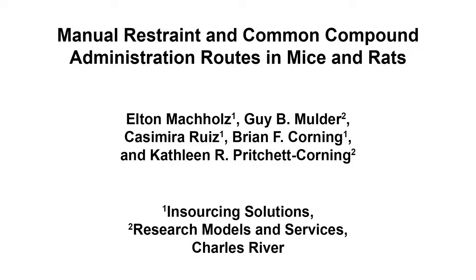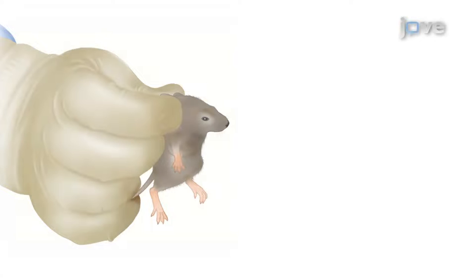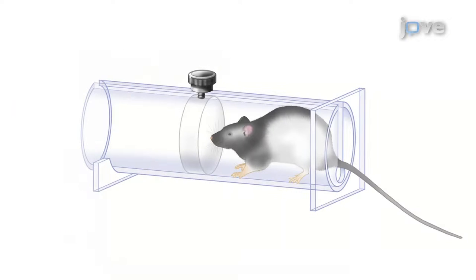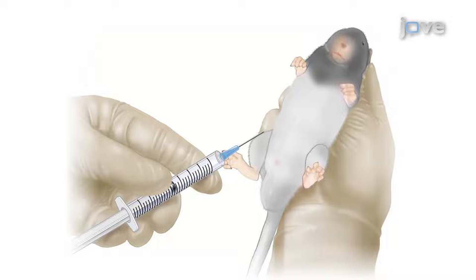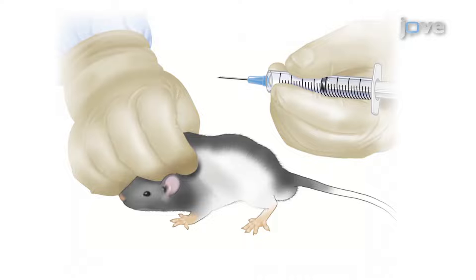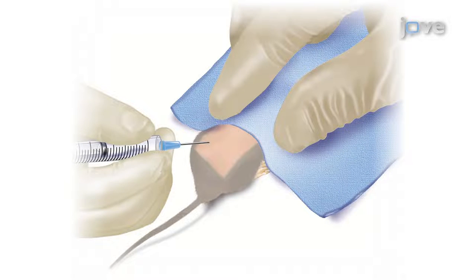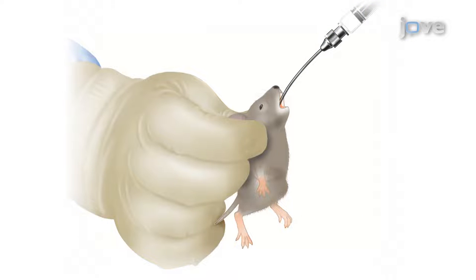The overall goal of the following video is to familiarize the viewer with various techniques used for manual restraint and compound administration in mice and rats. Mice and rats can be restrained by a number of one- or two-handed techniques or with the use of plastic restrainers. Techniques for compound administration such as intraperitoneal, subcutaneous, intravascular, and intradermal injection methods are demonstrated in this video, as well as oral gavage and intranasal administration.